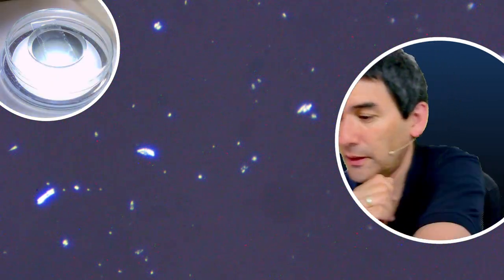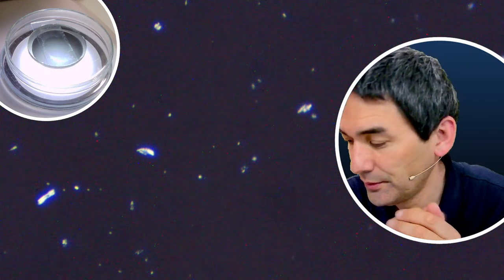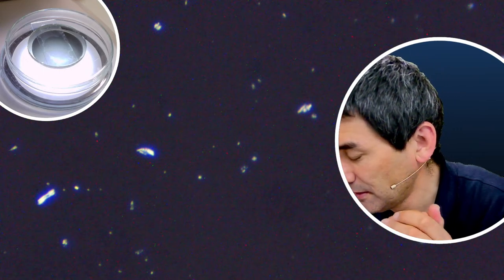Okay. And I'm going to turn it down a little bit. And I'm just going to be patient now. And I'm going to wait for it to crystallize out. Okay. Let's see what happens.